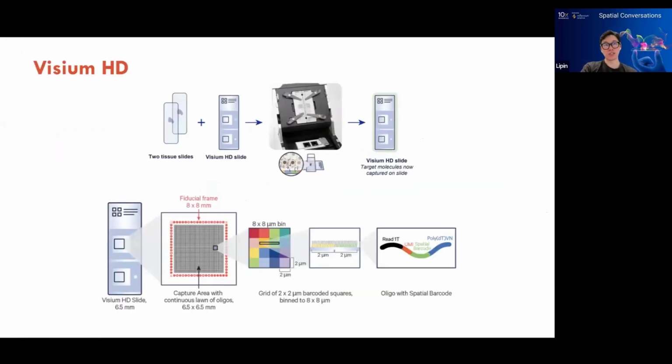And then I was also asked to touch a little bit on Visium HD before I wrap up. I have not done anything spinal cord wise on the Visium HD, but we're also developing some new therapies for pain and looking for changes in the brain. So I have done some Visium HD on brain tissue, which I'll share with you. So the difference between Visium HD and Xenium is that Xenium is an imaging based method, whereas Visium is actually sequencing based.